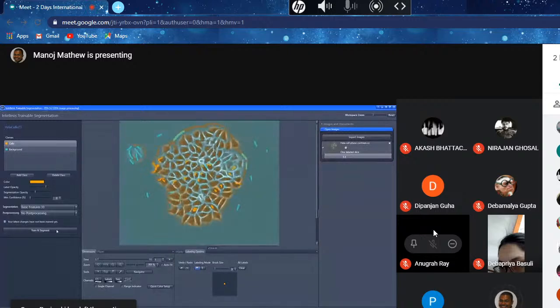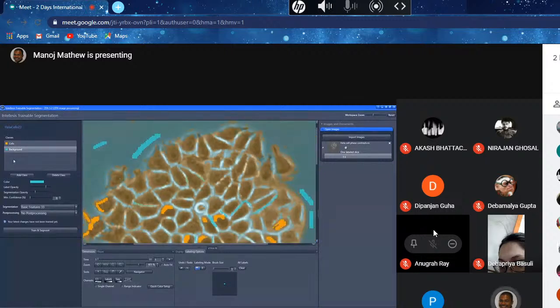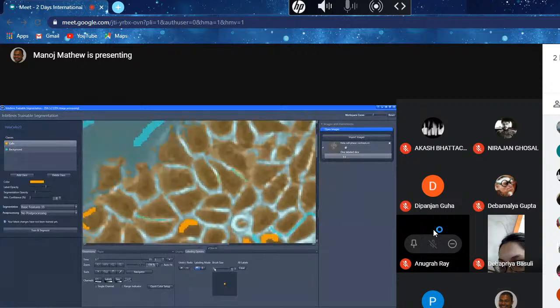All right, let's see what happens now. Okay, it improved, right? As you can see, with every iteration I do, the quality of segmentation is improving. Now we are very close to what we want. Small errors here and there. Keep correcting the mistakes, and with every step the algorithm keeps learning. Of course, as I was saying, the more labels I put in, the more computationally intense it gets.